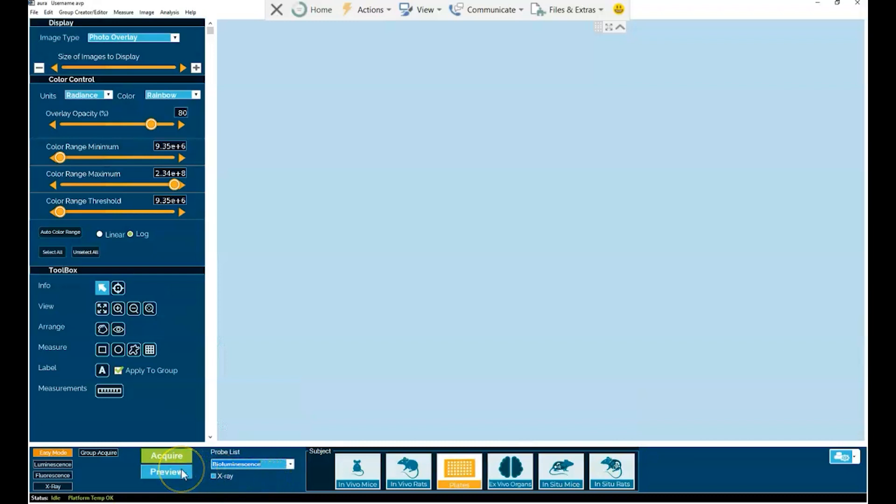It's as easy as that. One, two, and three. And now, you don't need to optimize camera imaging parameters such as exposure time, f-stop, bending, or object height. This is all done automatically through easy mode.